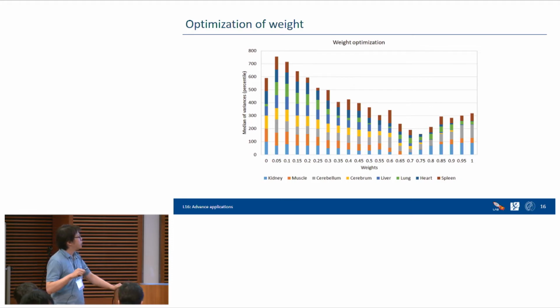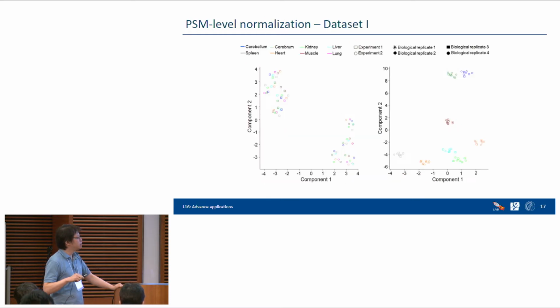And then the protein ratio will be the weighted median PSM ratio. So what is the weight? The weight here is the number of ions selected for fragmentation, which is an MS1 feature, and the MS fill time, which is an MS2 feature. We weight by these, and then the weight can be exponentiated. This means we can fine-tune this weight.